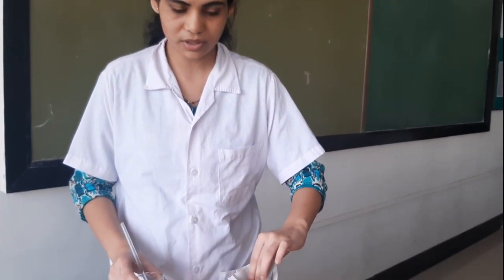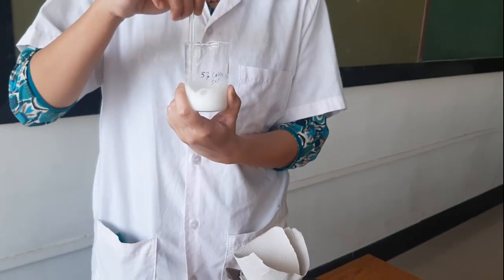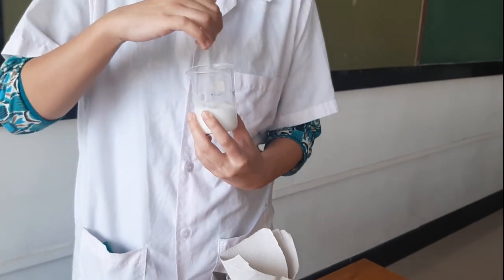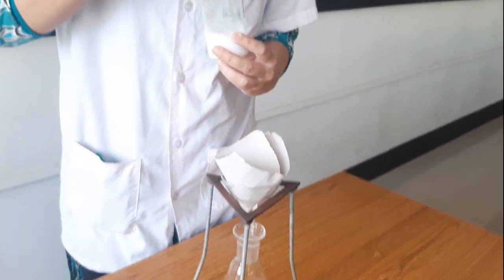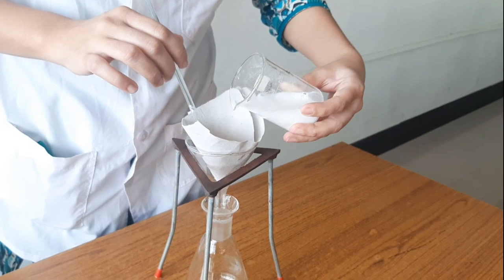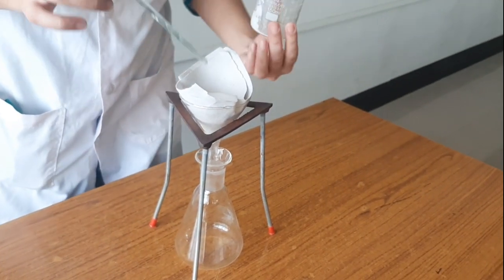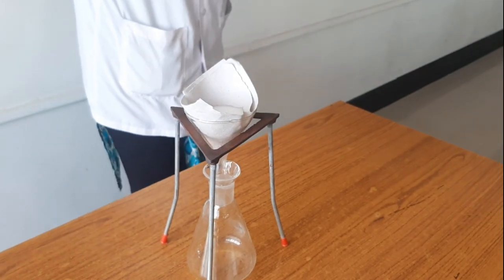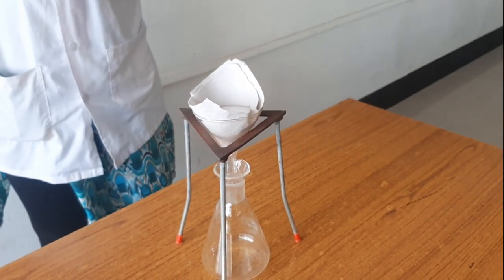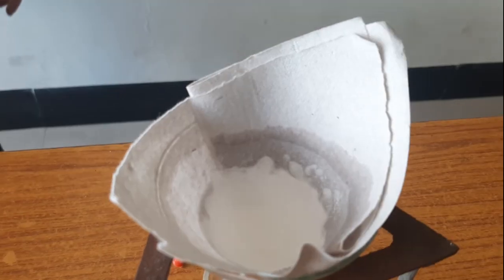We have arranged the assembly, and first we are going to pour the 5% solution of calcium carbonate into the filter paper. We have started the time. Now we will check what time is required for complete filtration.